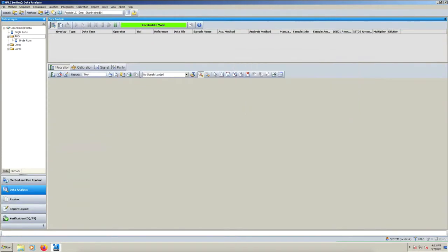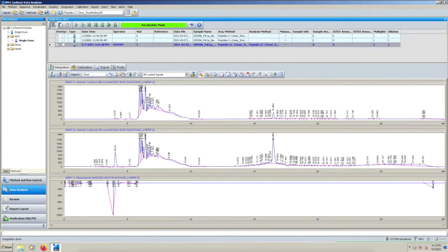Once the run is done, we can look at the analysis tab to get our different peak values, and we can print that off so that we can use that for a later reference.